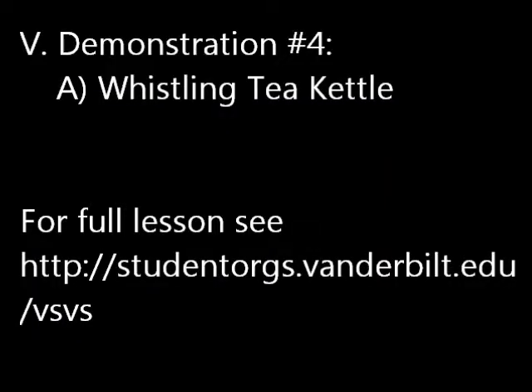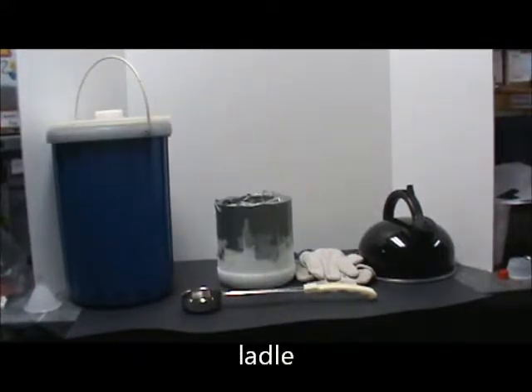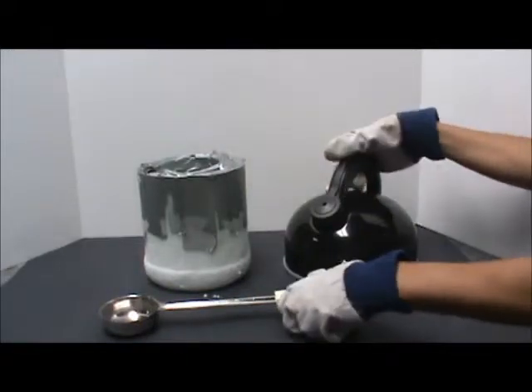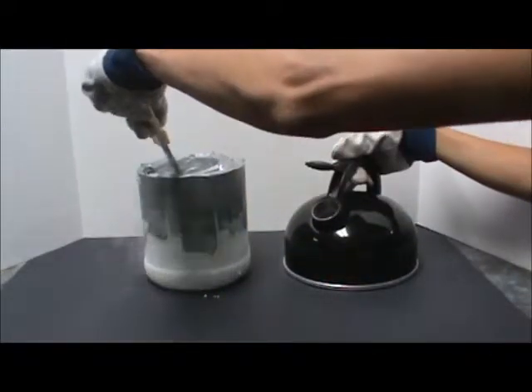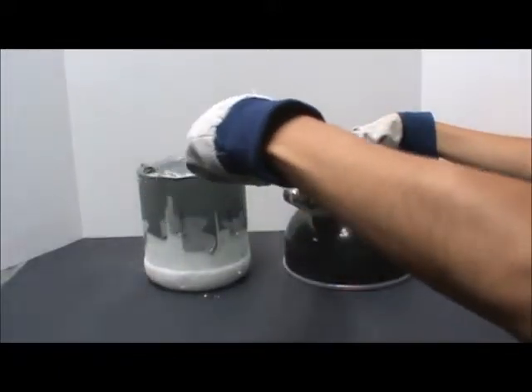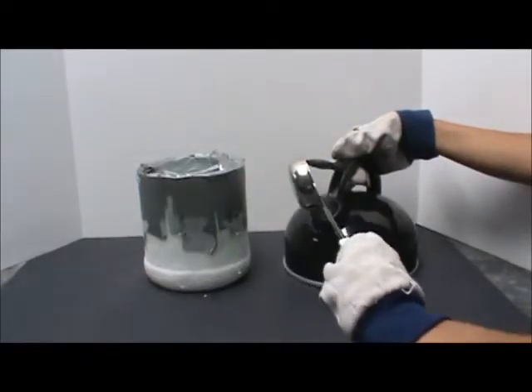Demonstration 4: Whistling tea kettle. For this demonstration you will need liquid nitrogen, a small dewar, a ladle, gloves, and a whistling tea kettle. Use the ladle to put some liquid nitrogen into the kettle. Ask students to explain why the kettle is whistling.